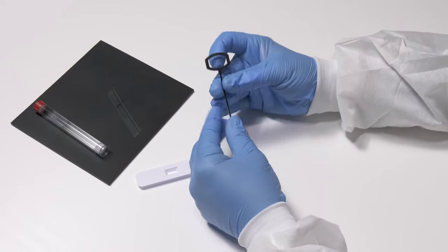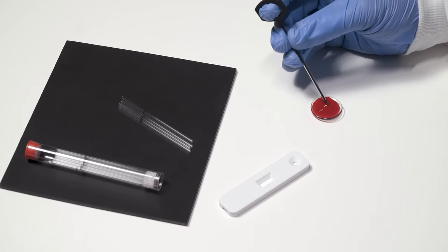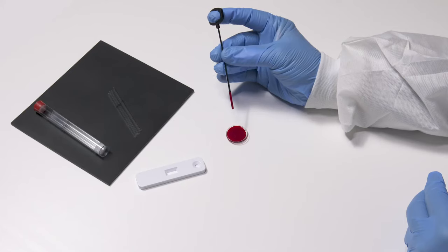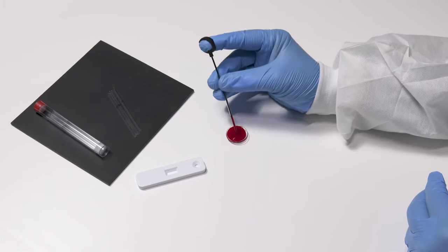After placing the capillary in the sample, gently pull the plunger upward to aspirate the sample. Control is easily maintained while filling to a calibrated indicator on the capillary tube.